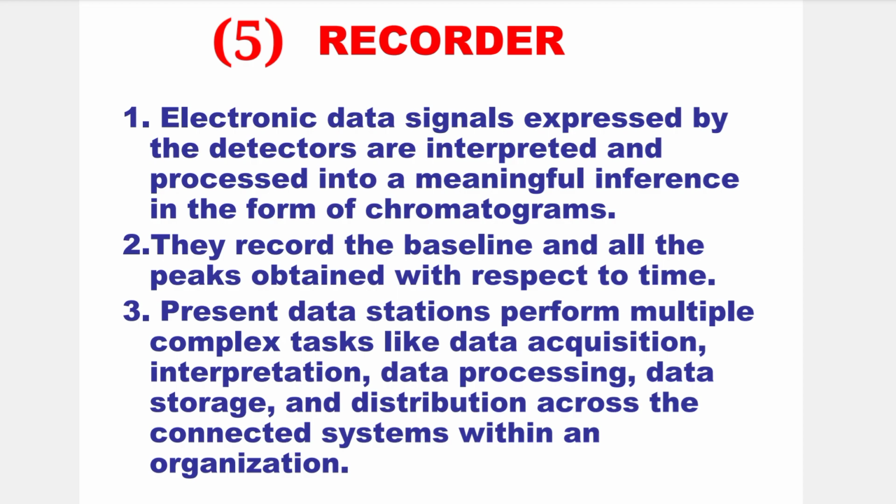Present data stations perform multiple complex tasks like data acquisition, interpretation, data processing, data storage, and distribution across the connected system within the organization.